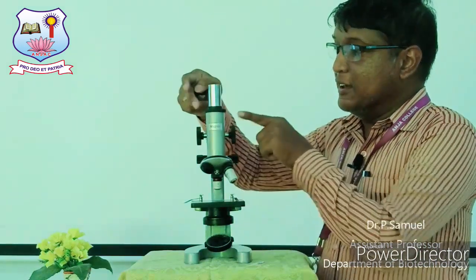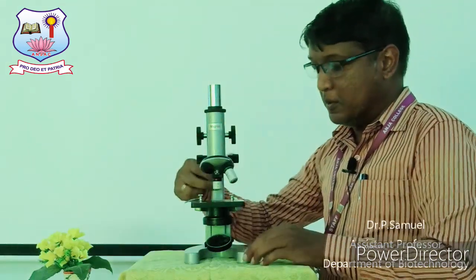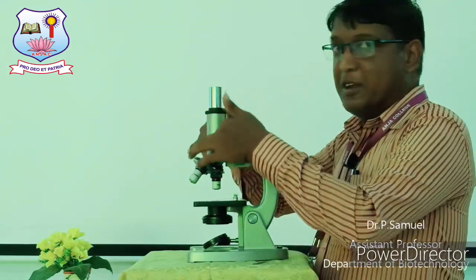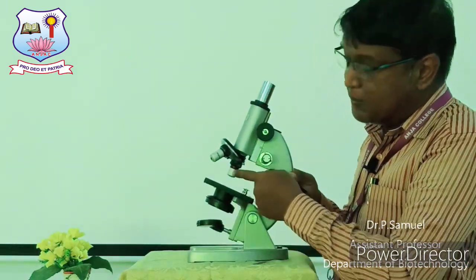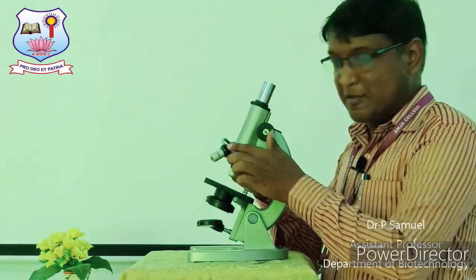This area is called the hollow tube. The reason is it is hollow in nature, right? The other end of the hollow tube is called the objective piece, or otherwise the nose piece.